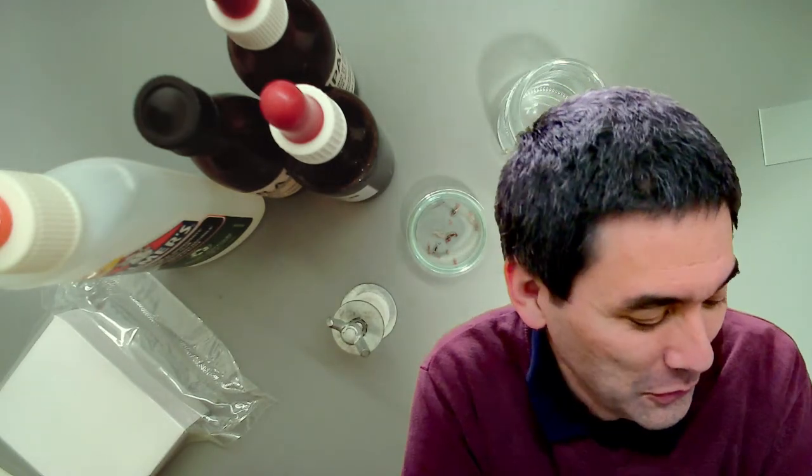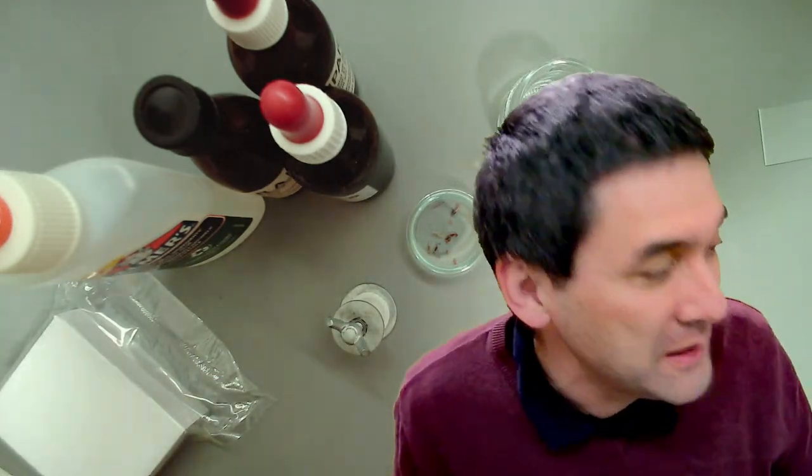Okay, so what will I be doing today? The thing is the following. I'll be simply making a few permanent slides, because I wanted to make them anyway, and so I told myself, why not just simply make it live together with you? So it's not going to be something totally new or exciting today, but I will be making some slides. Of course, I'll also be looking at them.